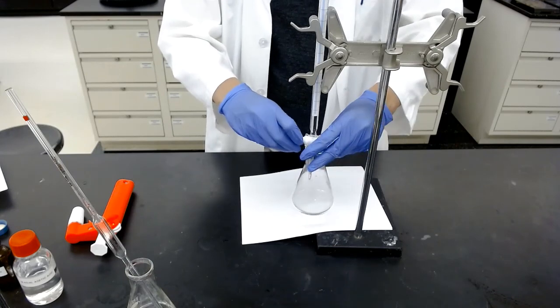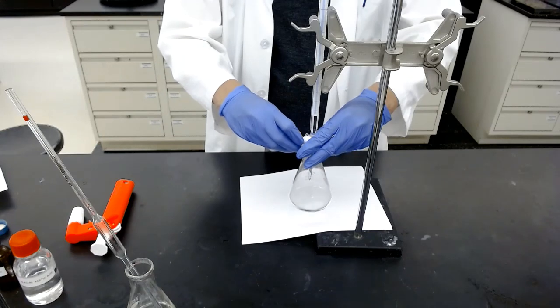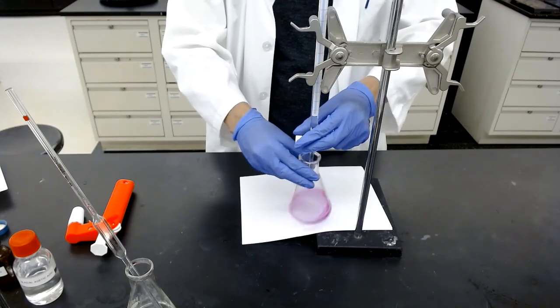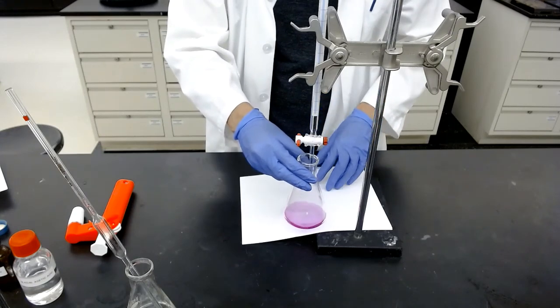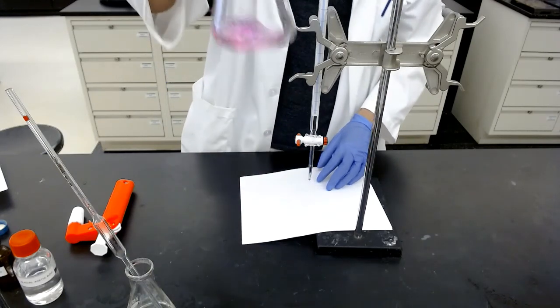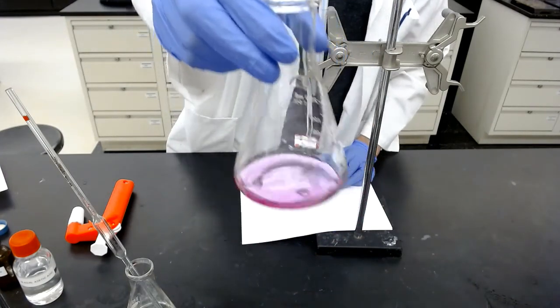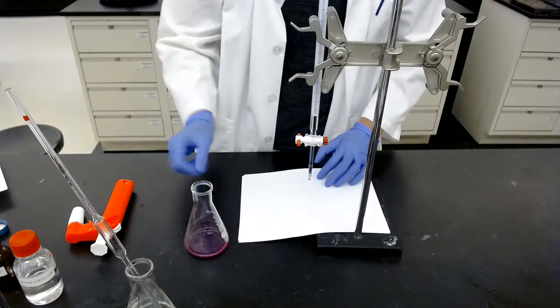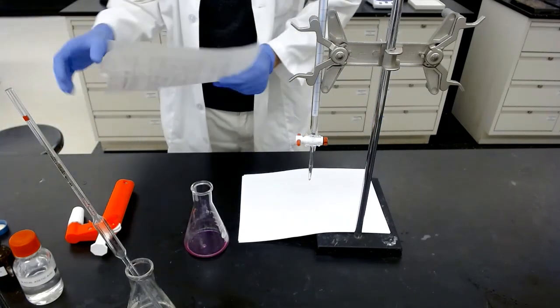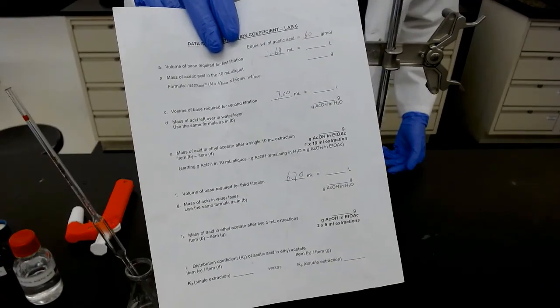It's getting close. Okay, that's it. Wow, the color changes instantly, right? Okay, yeah. So we say if you see the color change doesn't go away after shaking, which means it reaches the equivalence point. So now we need to record how much sodium hydroxide you have used, and you need to record it on the back side of this handout, right?